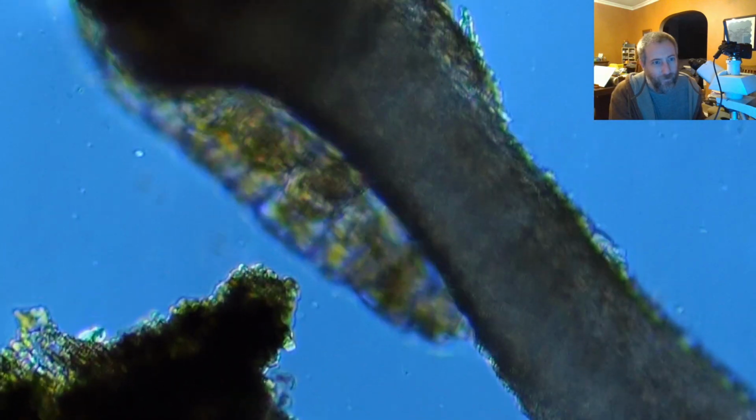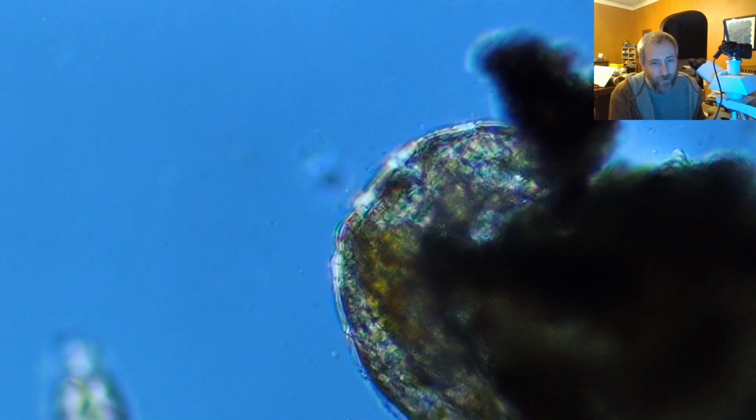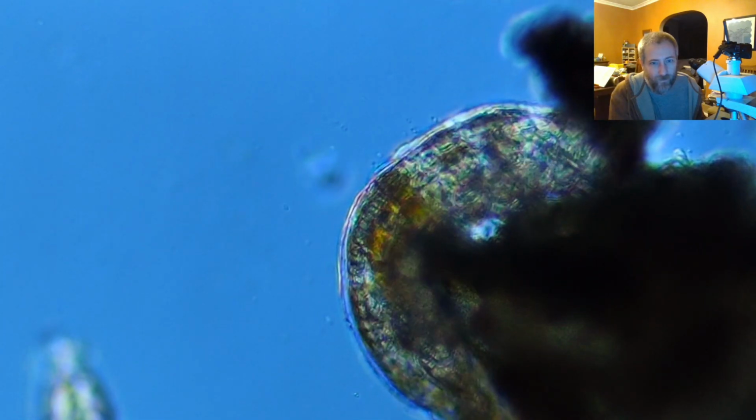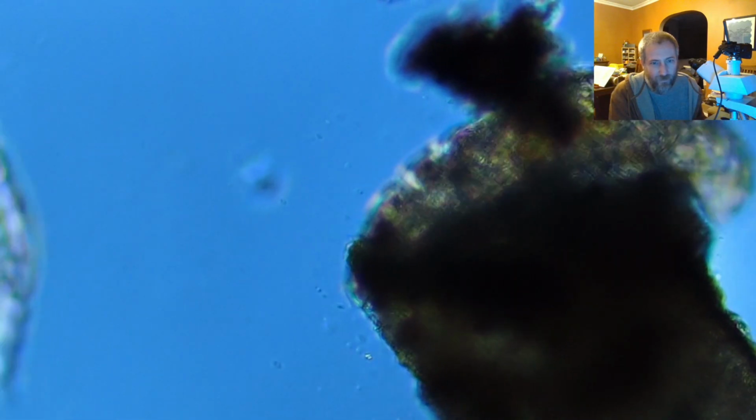And working on my fine motor skills here, trying to get both focus and movement as we're moving around. But you can sort of see its claws right on the ends of some of its feet right there. And they're sort of translucent or transparent.